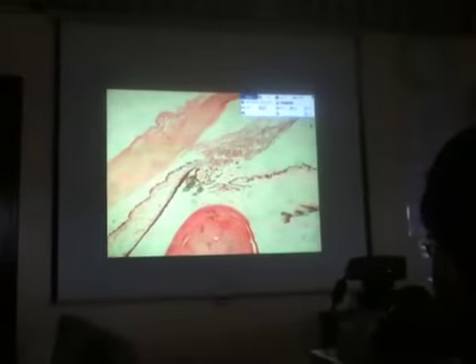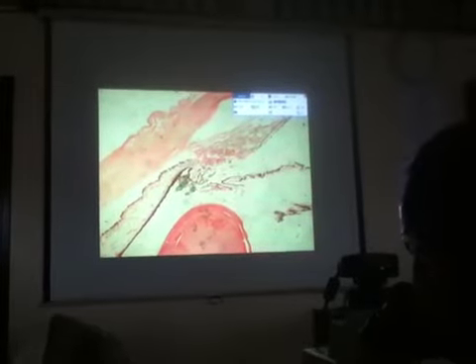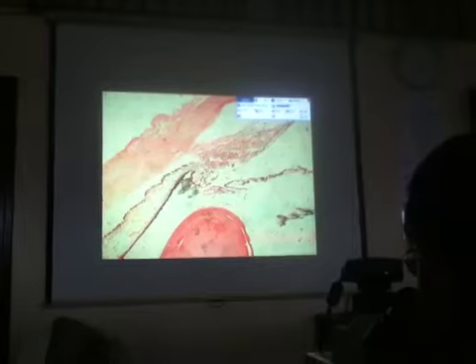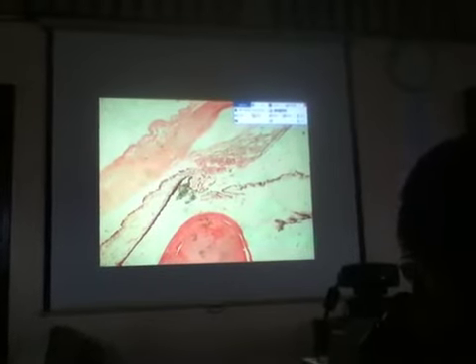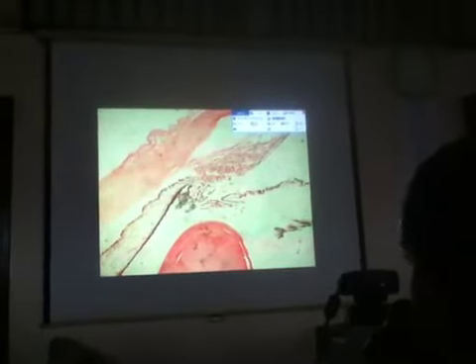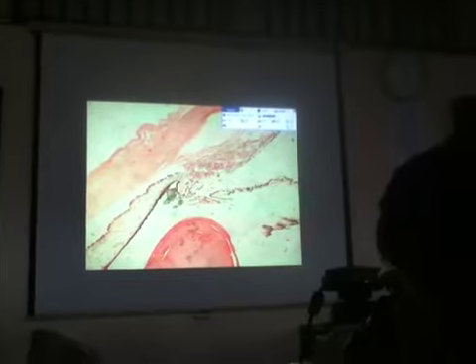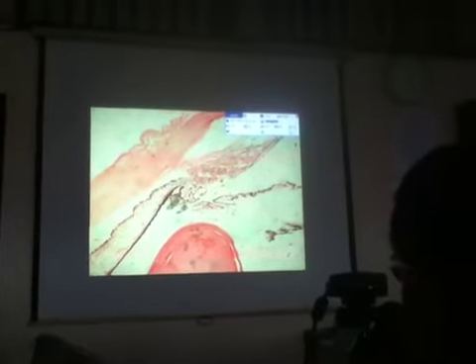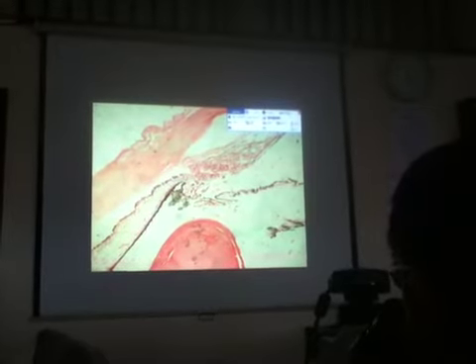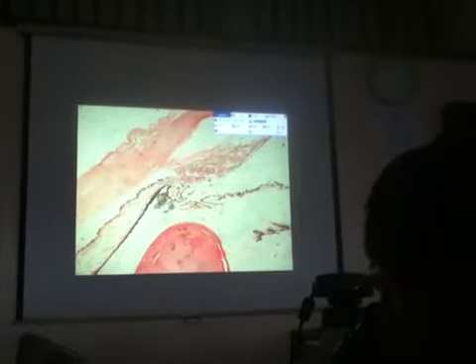Okay, that's the lens. And then the iris is attached to this structure, which is called the ciliary body. And then protruding at the surface of the ciliary body are these melanin pigmented, irregularly shaped structures which are responsible for producing aqueous humor. How do you call these projections? Ciliary processes. Okay, ciliary processes. And then the entire thing is the ciliary body.